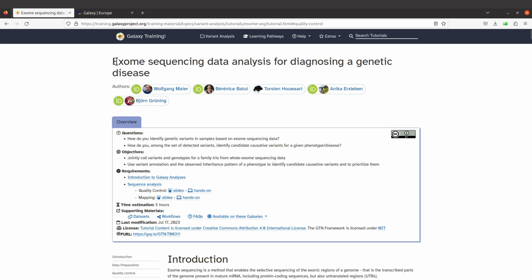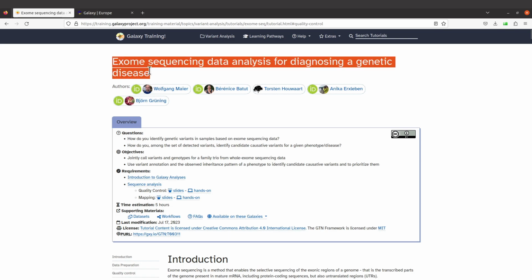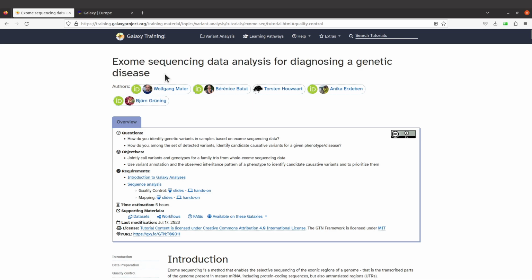So in this tutorial, the authors showed how to perform exome sequencing data analysis for diagnosing a genetic disease. This tutorial includes a variant calling step, and that is what we are going to reproduce in this video. All right, so I am not going to go into details with this entire tutorial. I am going to look at just the variant calling aspect. I will later make a tutorial where I look at this particular topic in its entirety. So I repeat, for this tutorial, we are going to look at the variant calling aspect.